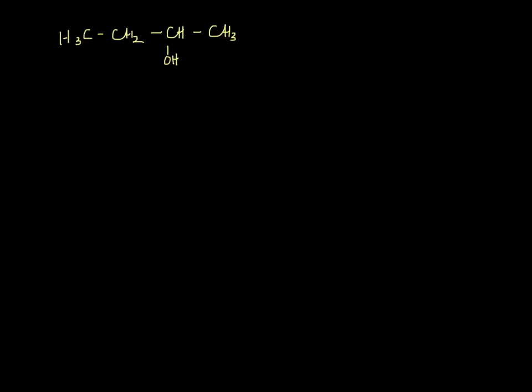All right, welcome back. Let's go through these peaks one at a time. So this would be peak A. Notice that all of these peaks are going to be different. There is no symmetry in this molecule. This would be B, C, D, and then the OH would stand by itself as E. All right, so we can put this into a nice little table, and we'll label each of these A, B, C, D, E. And let's go first into the chemical shift.